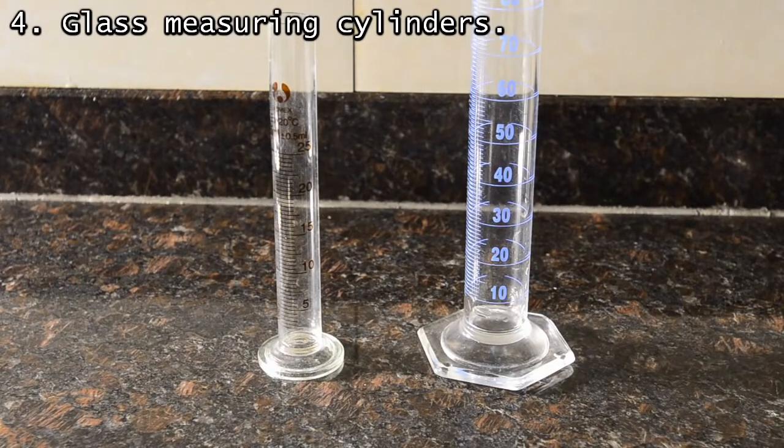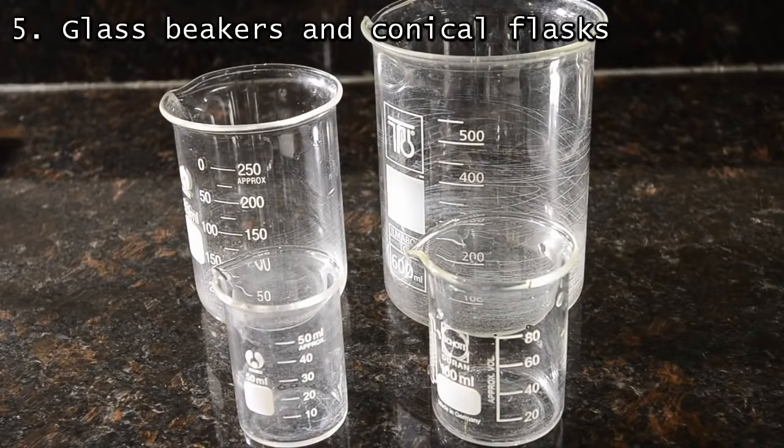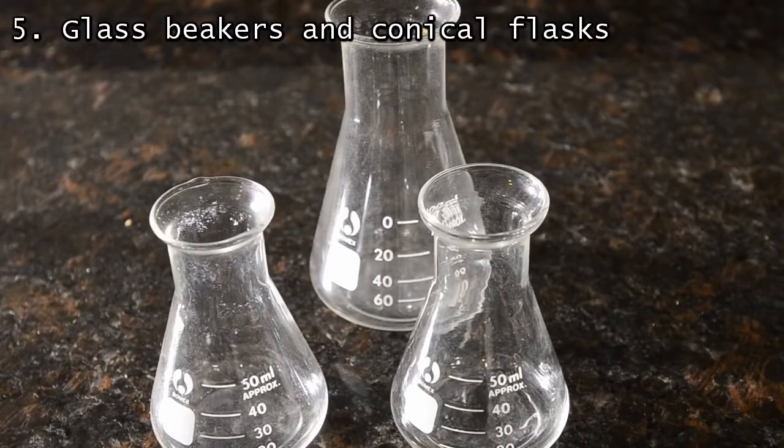Again, it's really important to be able to accurately measure. We use two measuring cylinders — 25 ml and 100 ml. Because we tend to use smaller beakers more than the larger ones, we have an assortment of sizes. We've also got a few conical flasks, which we find useful for more volatile solvents.